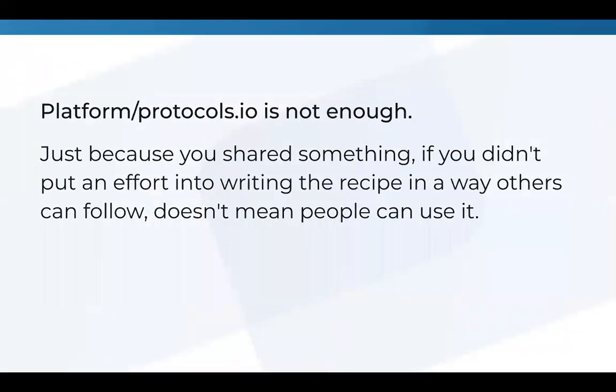And so what I really want to say here is that even if you do have protocols.io or a platform, or if you are sharing your method, just because you share something, it's not enough. Even if you use protocols.io, it's not enough to just put your method there. You really have to think about if others can understand what you are sharing. Just because you shared something, if you didn't put an effort into writing the recipe in a way that others can follow it, it doesn't mean that people can use it.